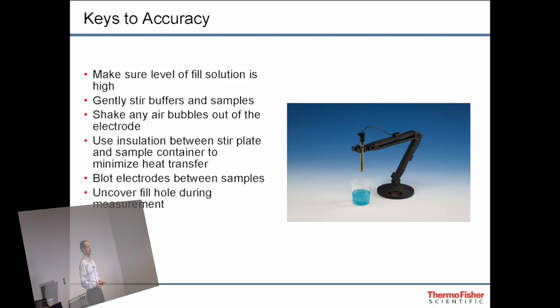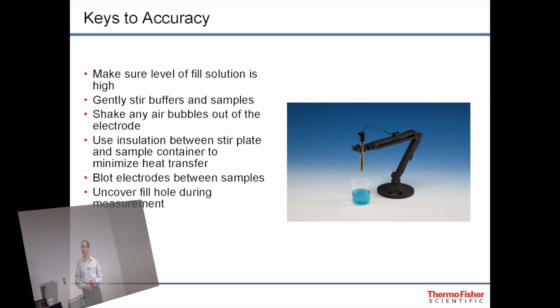Stir. We always recommend that you stir your buffers and your sample. If you're stirring, you're going to get a quicker reading and a more stable reading. So always stir your buffers and your sample when you're calibrating and you're measuring.